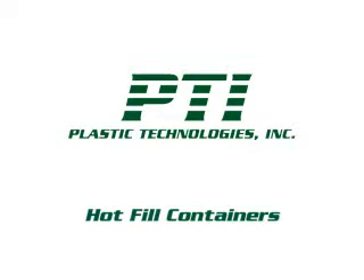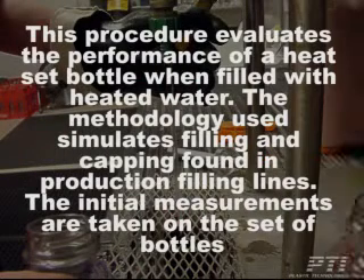PTI's Procedure for Testing Hot Fill Containers. This procedure evaluates the performance of a heat-set bottle when filled with heated water. The methodology used simulates filling and capping found in production filling lines.